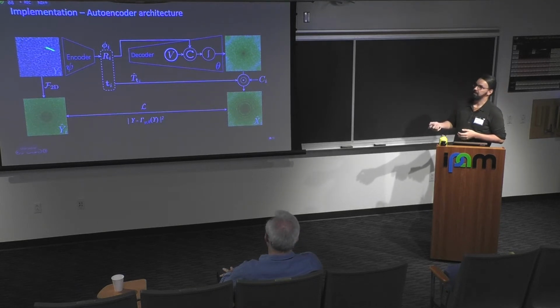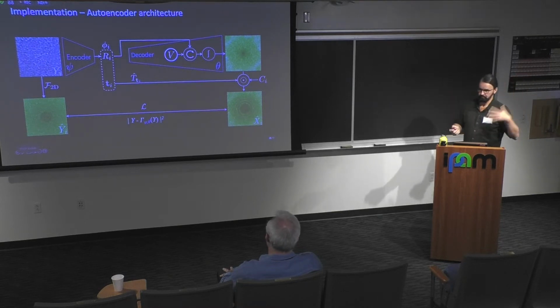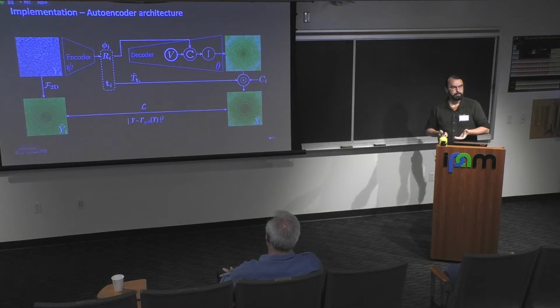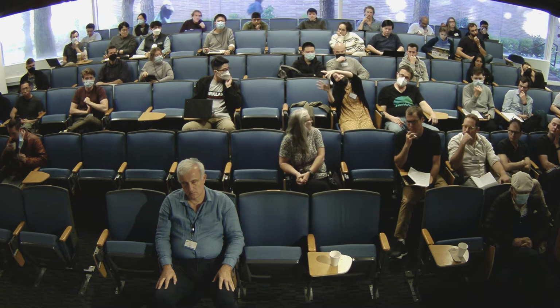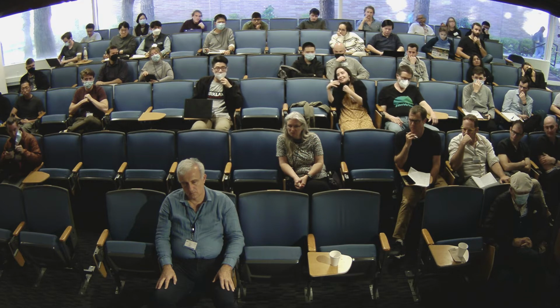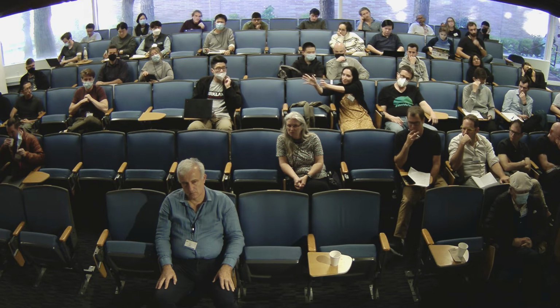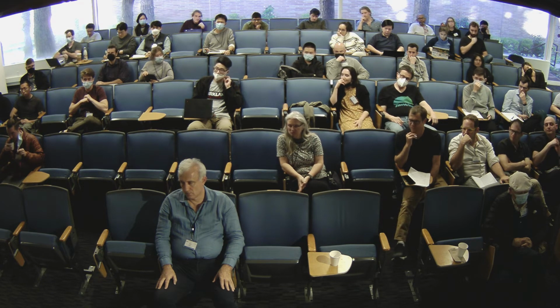Once we have converged, we can just use our encoder as it is and ask it on new data what is the pose, and that would work if the new data is similar to the data that we used for training. Can I ask a question here? Yes, please. So can you have a leave-out set where you measure your loss on the leave-out set? Does that make sense here? On the what? Some images that you don't use in your training. Left out. Okay, yeah. Left out, yeah. No, I didn't hear. Sorry.